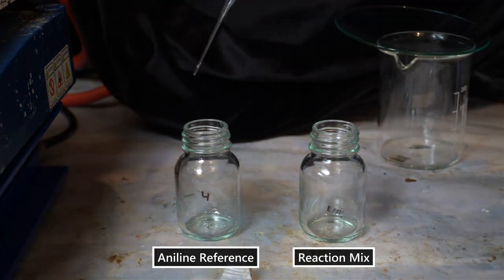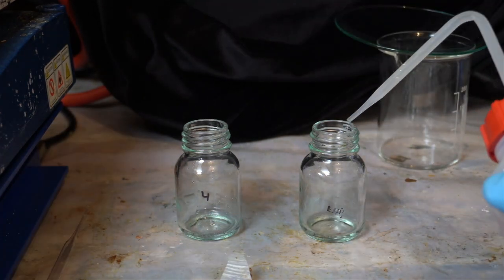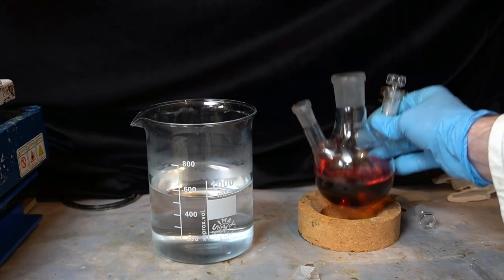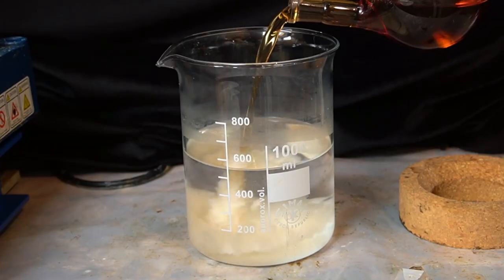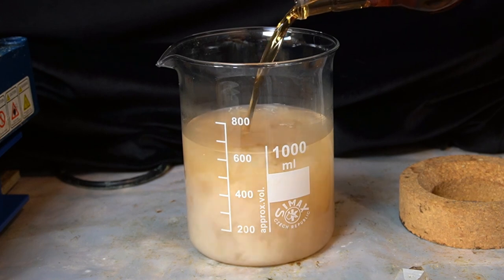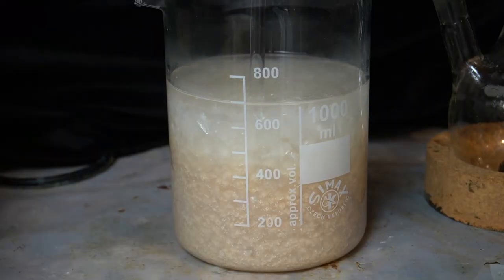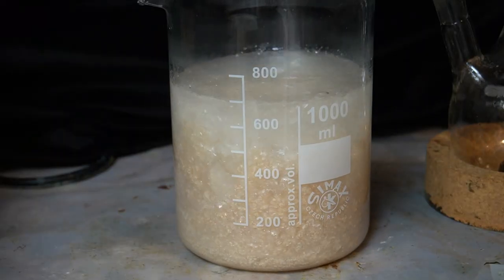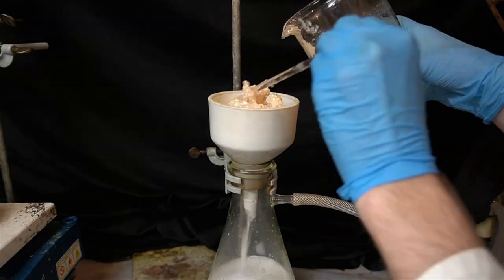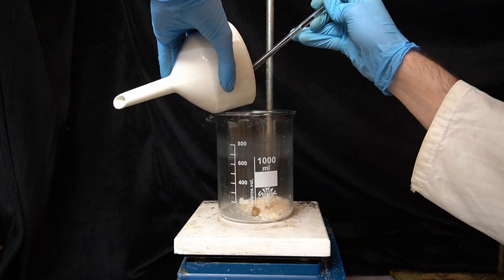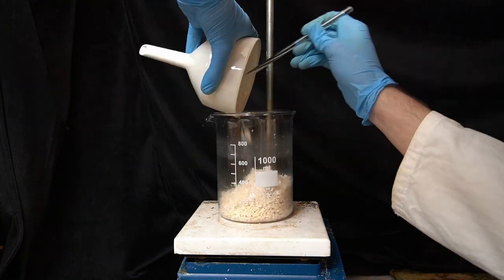After the reflux, I prepare TLC to check the reaction progress. As you can see, all of the aniline has been consumed, so we can now isolate the product. To precipitate the compound, the reaction mix is poured into a beaker containing 500 mL of water. Because acetanilide is very insoluble in water, it immediately crashes out. The crystals are now filtered and washed with some more water. The crude product still has a brown color, so to purify it further, I will recrystallize it.